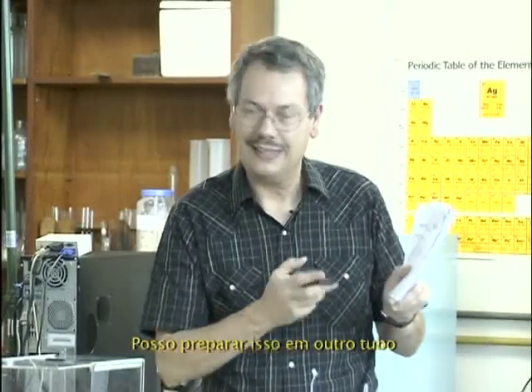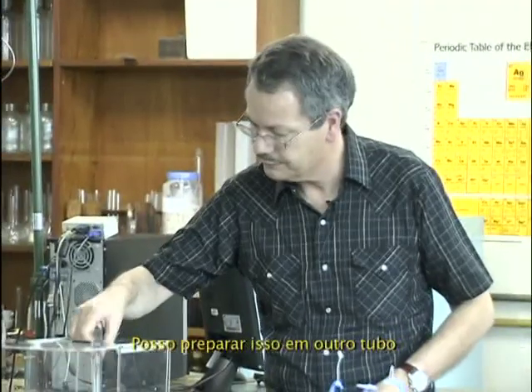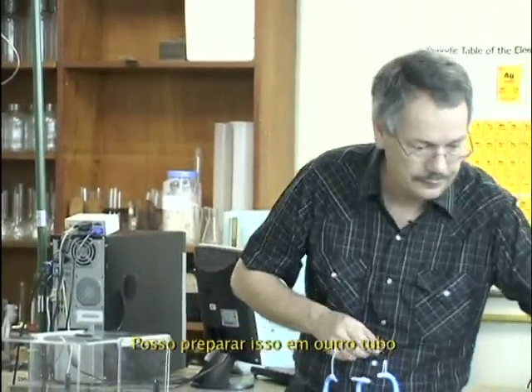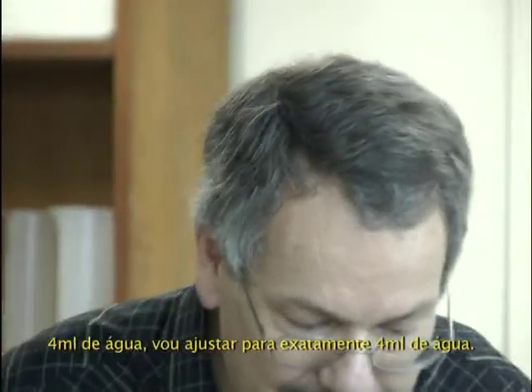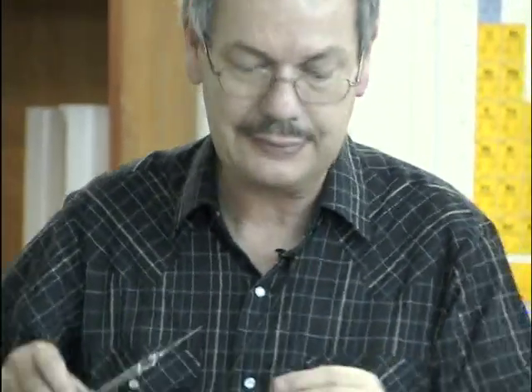But still, I can prepare this in another tube, 4 mL of water. I'll adjust it exactly to 4 mL. Where is my water? This and this.